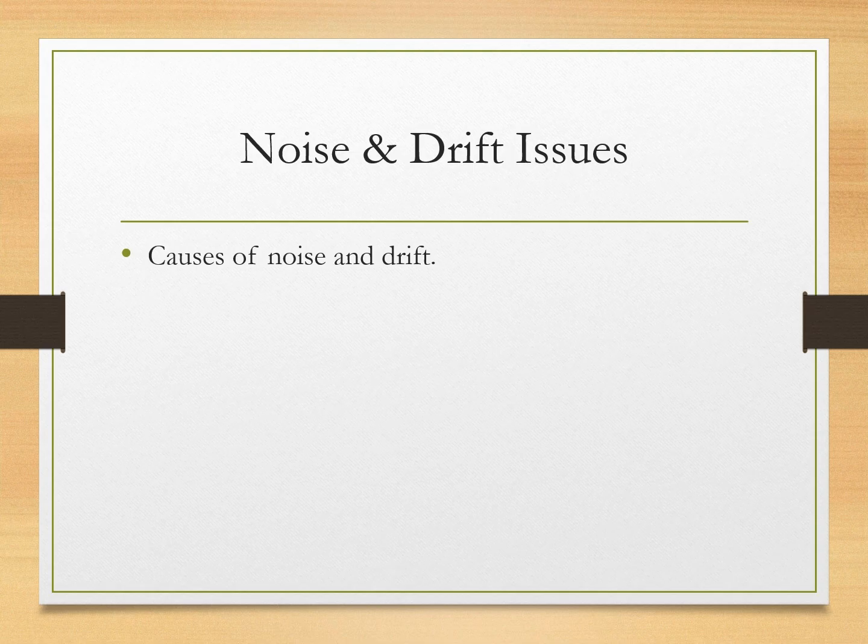Noise comes from electrical fluctuations. Drift happens when lamp intensity changes over time. Double beam instruments minimize drift. A double beam instrument gives more accurate results as compared to a single beam instrument.